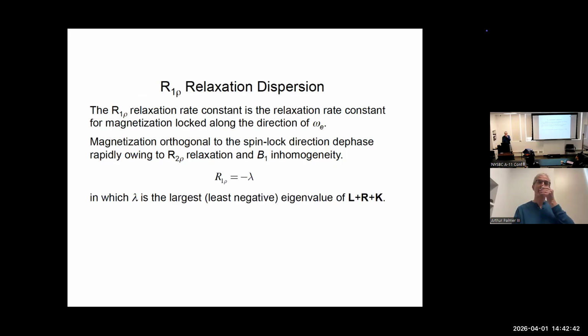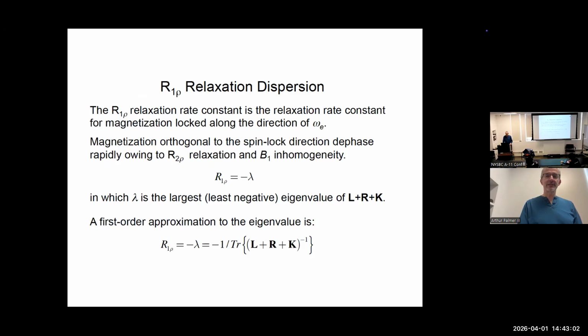So that approach is kind of like going into the spin lock frame. Or spin lock, everything that's not commuting, you discard everything that's not commuting, and then you say, what's left? There's going to be one that's big and one that's small. Let's just find the small one.